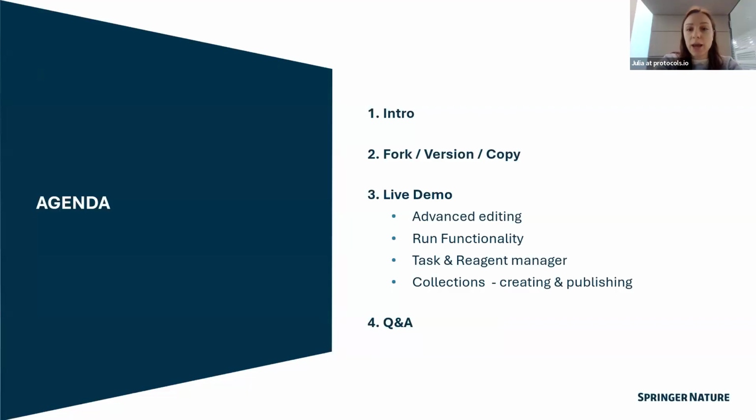For the presentation today, I will have a couple of slides as a reminder of the overall concept of protocols.io. That will be very brief. Then I'll have a slide talking about some of the different terminology that is important and that we use on protocols.io. You should be familiar with it already. And then I will jump into the live demo portion, so we'll move out of the slides onto the platform. It will be very practical information, some advanced use of the editor, run, task, and reagent managers, and then the questions at the end.